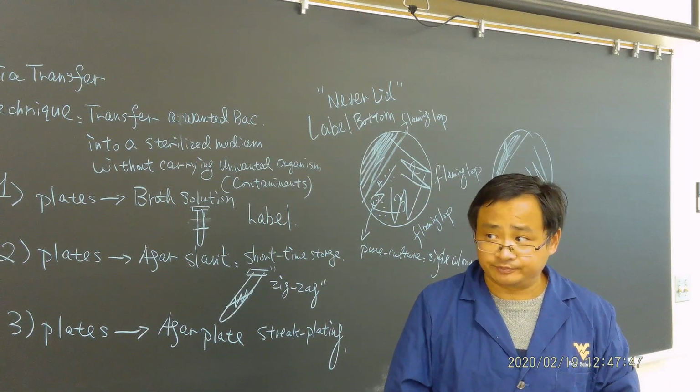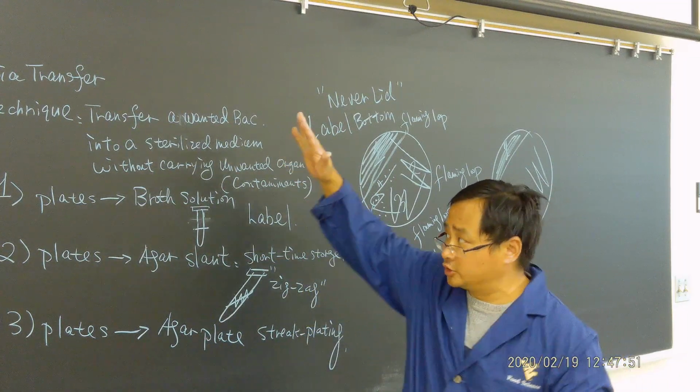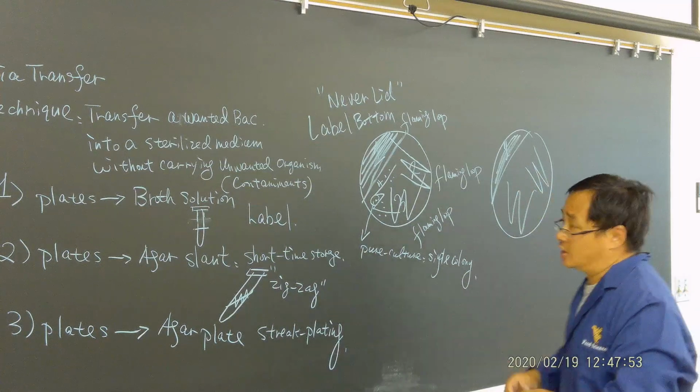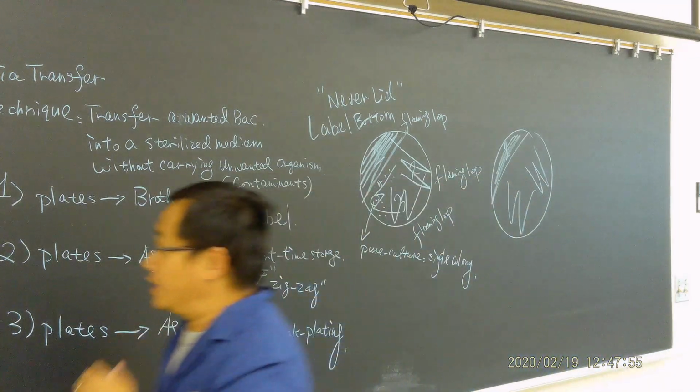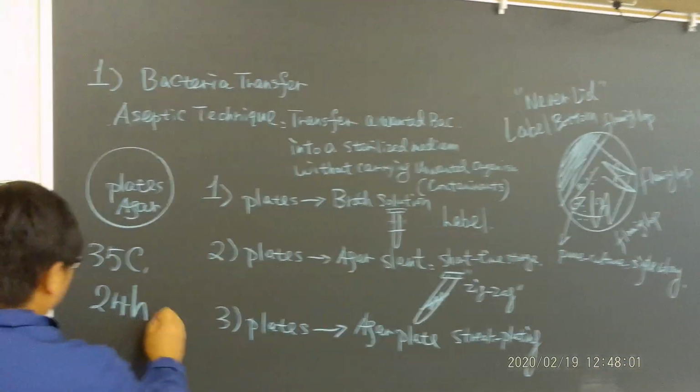That's very important. Now you're going to give those to the TA, and she will do the incubation for all of these. All these plates and the tubes, we will incubate at 35 degrees Celsius for 24 hours.